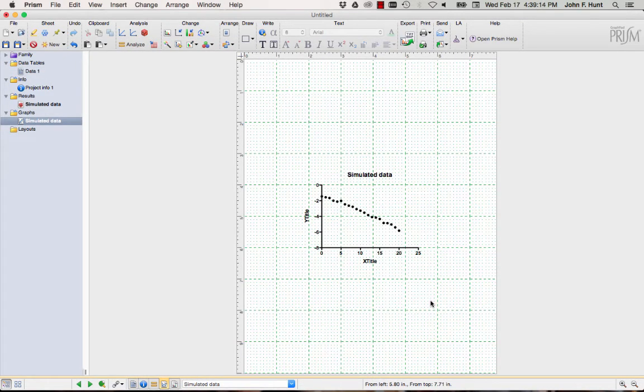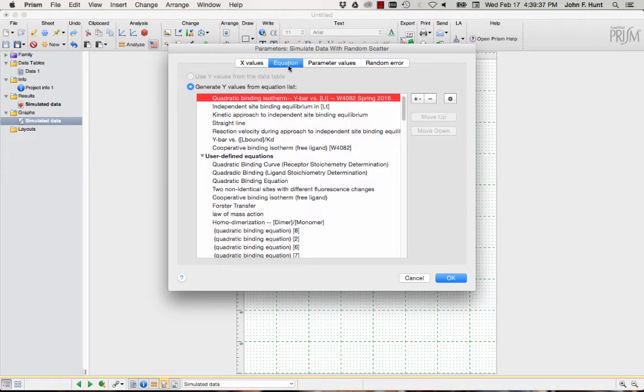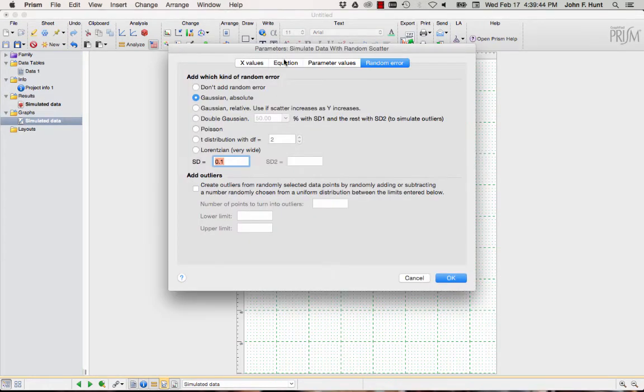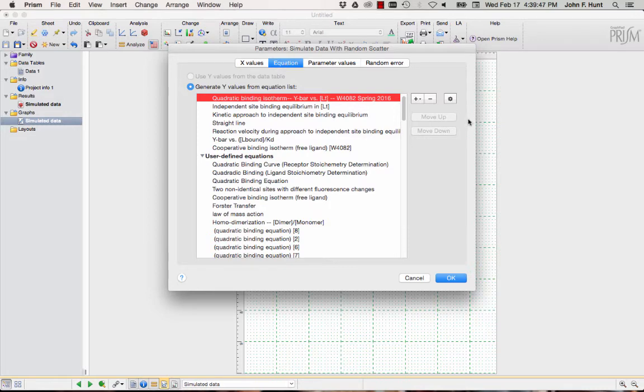Okay. And something now went grossly wrong. This doesn't look like a binding curve. Well, we do at least have data going in steps from 0 to 21. This was somewhat of a hazard of entering a binding curve on the fly. Anyway, I can actually now change this equation. Just to review what I just did, this is the change menu, change analysis parameters. One of the analysis parameters is the equation. I can actually change the equation.